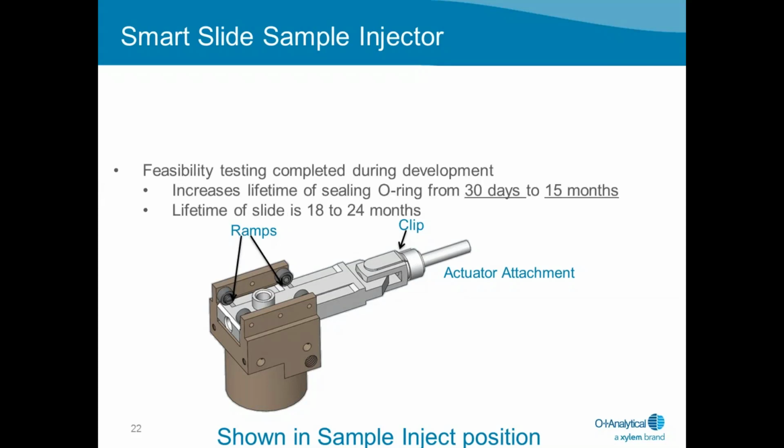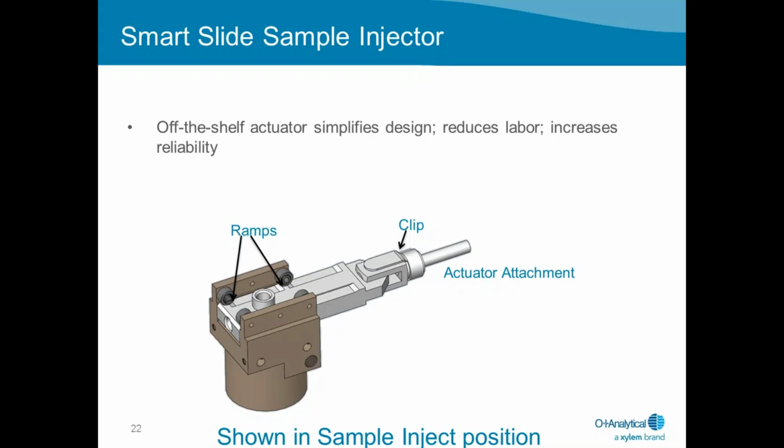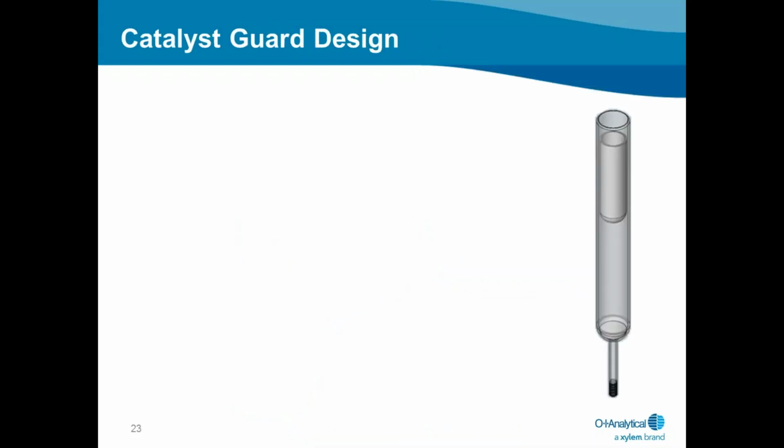In our feasibility testing, using salt samples, the lifetime of the sealing O-ring was extended from 30 days to 15 months. And the anticipated lifetime of the slide is 18 to 24 months. Some additional features of this particular design: there's an off-the-shelf actuator that simplifies the design, reduces labor, increases reliability, and a quick disconnect linkage that easily detaches from the actuator and the cap for easier maintenance.